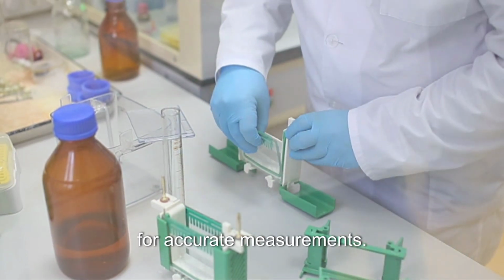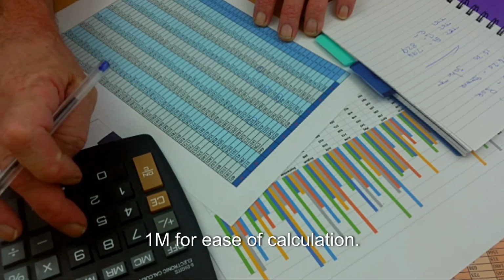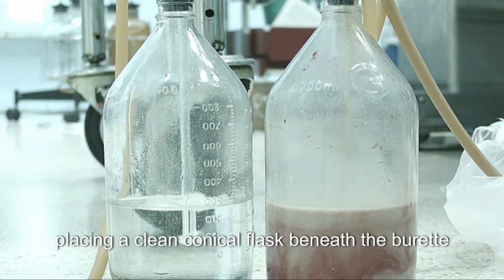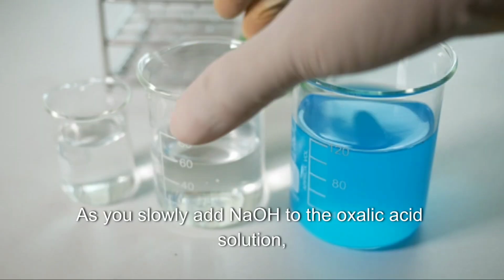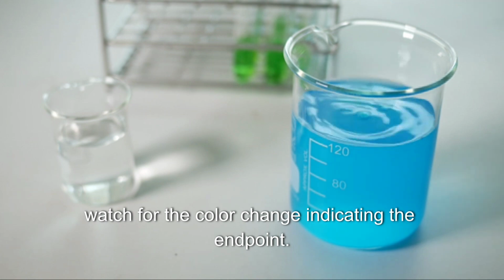for accurate measurements. The solution's concentration should be known, often around 0.1 M for ease of calculation. Next, set up a titration apparatus, placing a clean conical flask beneath the burette filled with the NaOH solution. As you slowly add NaOH to the oxalic acid solution, watch for the color change indicating the end point.